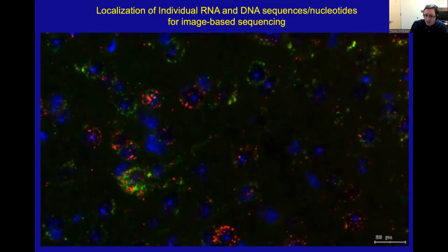Now, our group, and we have people from MIT already doing this in our facility, they're using just the basic TissueFAXS system, the TissueFAXS Plus, not even the confocal version, as an RNAscope. And so what we've also tested ourselves, and it does work a little bit better with the confocal because you have better signal to noise, is to do single cell image-based DNA sequencing.